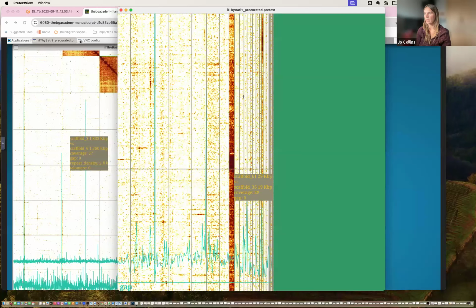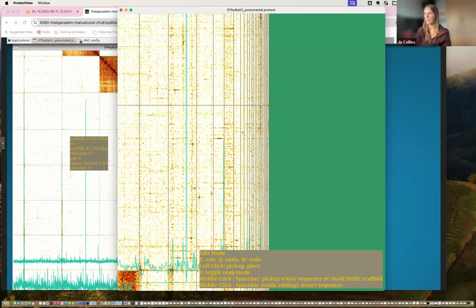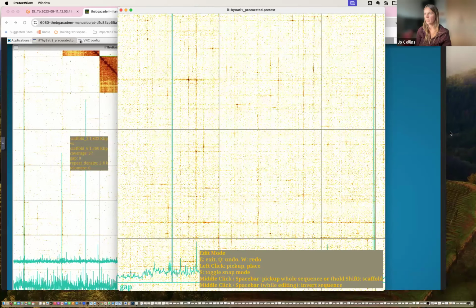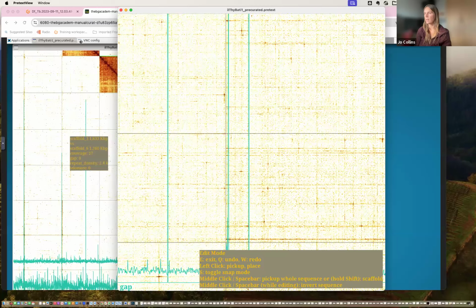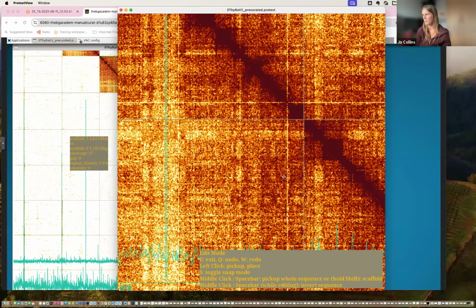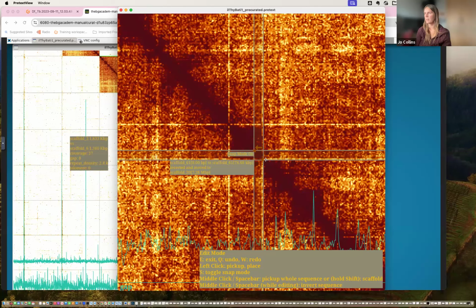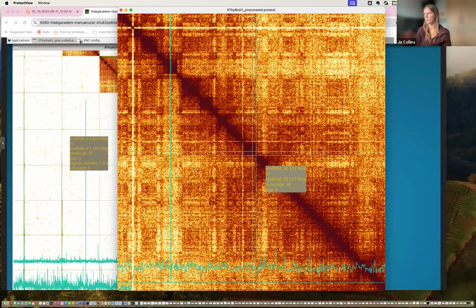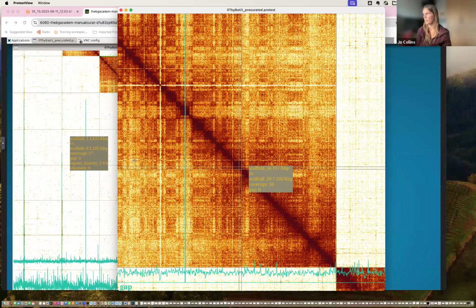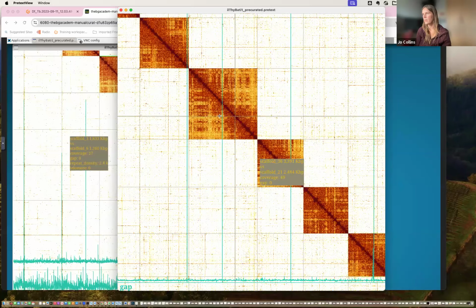Happily, we've got something that goes in between those bits that we've moved in, because that helps us. It's just another piece that fits in there, and that's actually got signal that we need. It's not great, but I think it must be like that because it has better signal with the scaffold that it joins into. I think that was everything. Okay, and let's go down to the next stage.